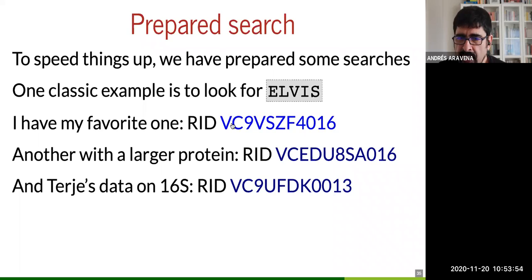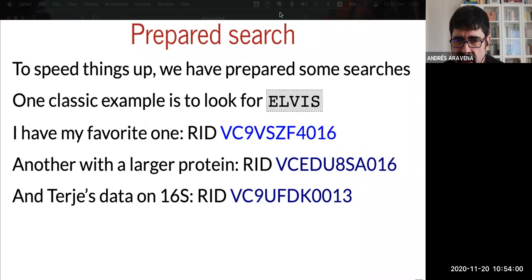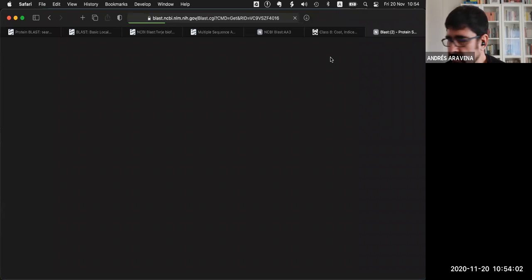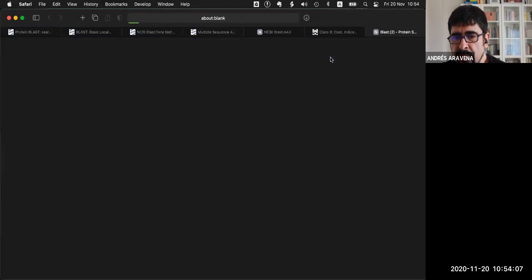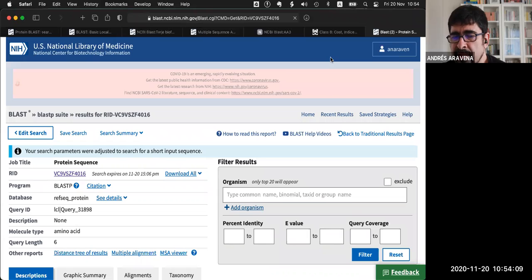So if you like, I will give you the link here, and if I click here, it will open a new window and show the result of a search that I did yesterday.